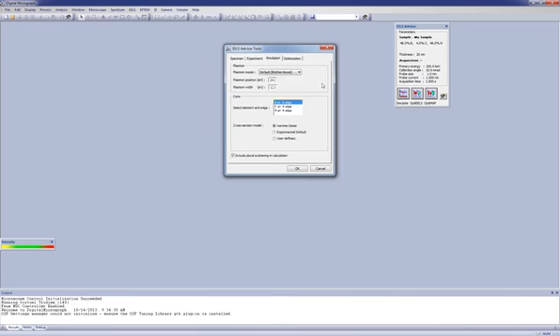If we hit the simulation tab, this is if you want to play around with some of the parameters that are currently used in the simulation. I mentioned before that the basis of EELS Advisor is being able to simulate the different components of the EELS spectrum. So we have certain defaults that are used in the software for the simulation model and for the plasmon parameters.